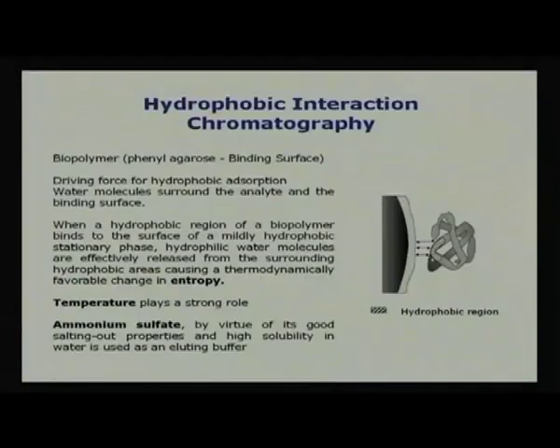In ion exchange chromatography, what did we do? We first added our protein molecules to the column, and during elution we used NaCl, that salt, and it dragged the molecule out of the column and we isolated, we separated our targeted protein. Here it is just the opposite.